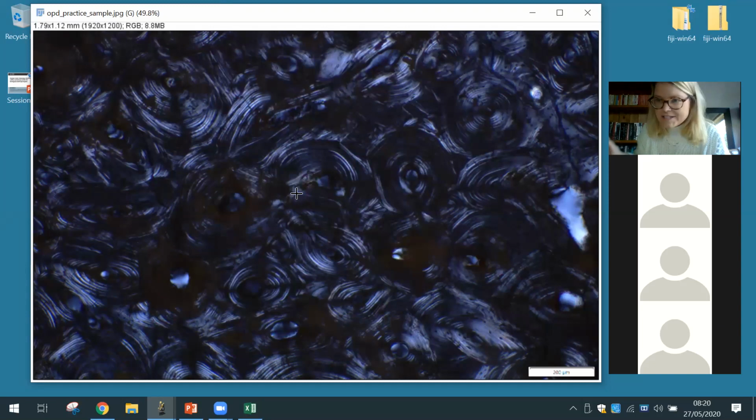But just for today, quickly, let's start with the intact ones. So I would click on that one. That's probably intact. This looks intact to me. This one's possibly intact as well. I think this one looks like an intact osteon. All of this black stuff here, all of these patches of dirt, this is just bioerosion. It's just because it's an archaeological sample. So as you can see, that can also obscure some of the features in your thin section. Here, it's actually obscuring some of the Haversian canals.